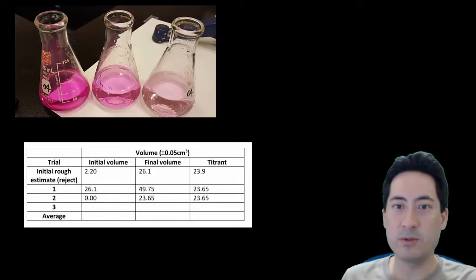If I add one more drop, it would have put me over. And so I'm thinking 23.65 is the answer. And I did get it twice. So I really should do it three times, but I'm going to stop there because you can get away with two if you know you're spot on. Ideally, it would be best to do it three times.